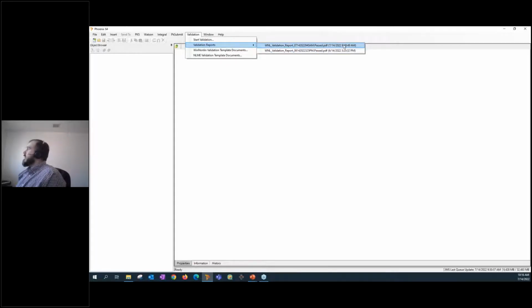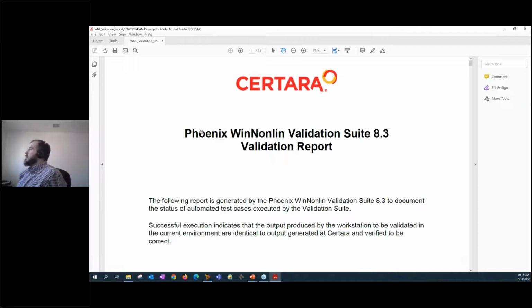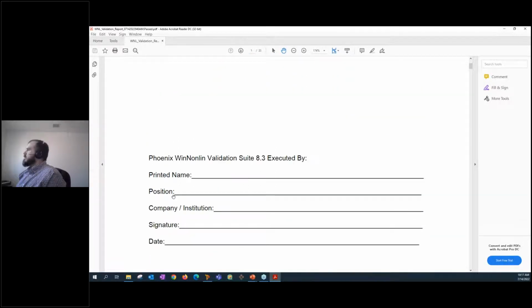Now you can see here I ran a validation report right before this webinar, so I'll just go ahead and select that. And what you'll see here is this PDF file opens up that gives you a signature page for you to verify the validation was completed, and then you can sign off and use that for your company.